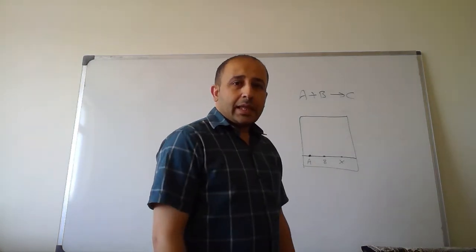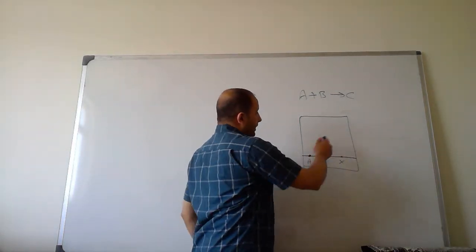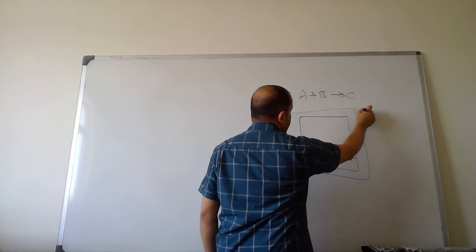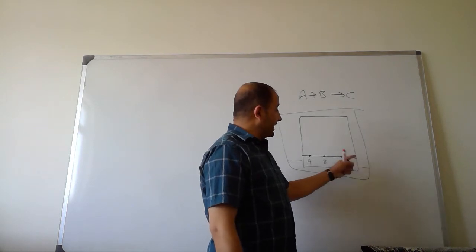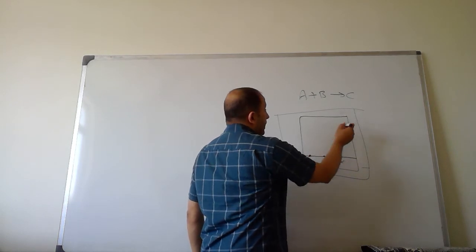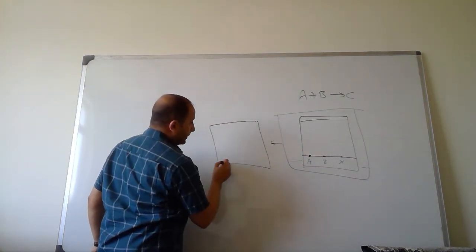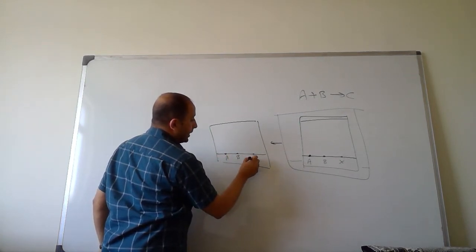measure the content of the sample. So after applying thin layer chromatography in a jar, we close the jar and we fill it with mobile phase. The mobile phase should not exceed the line of the application. After a certain period of time, the mobile phase will reach a point, and we can dry the plate in order to see now what happened for the analytes.